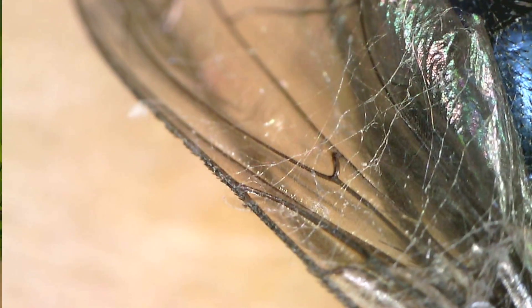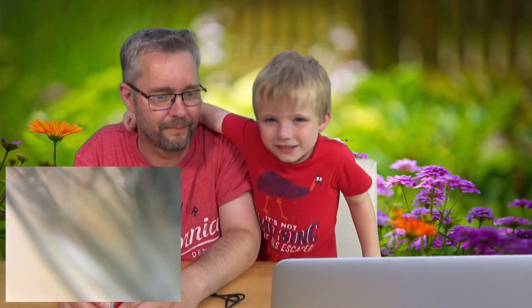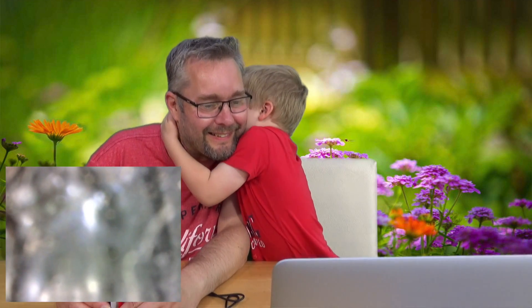We're working our way up to creepy stuff now. We've got a big fly. Shall we have a look at that now? If you don't like creepy things, I'd turn away now. Because we've got a fly — we found a dead fly in the conservatory, so we thought we'd have a look at it. Let's zoom in. Look at those wings — it's got a few cobwebs on it, I think. The little wing itself has got little hairs on it. How many of you are going 'bleh' at the moment?